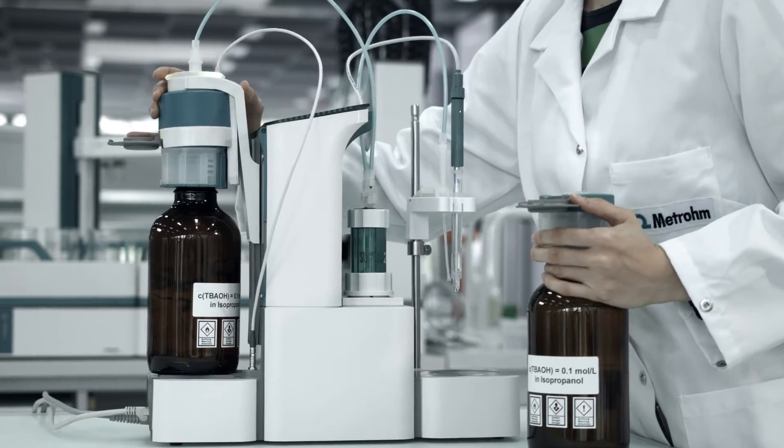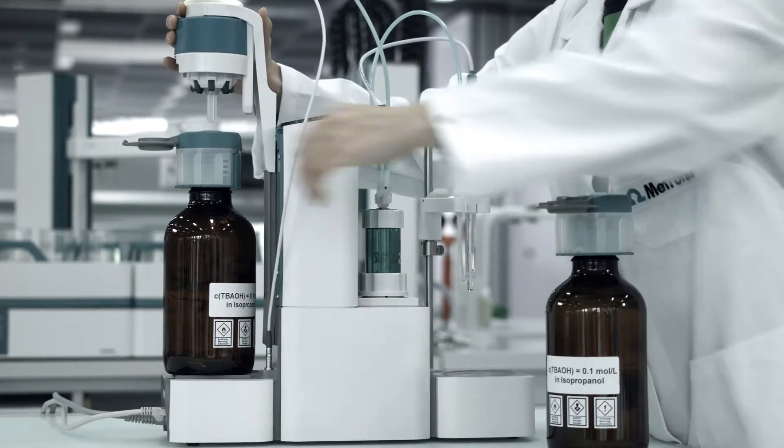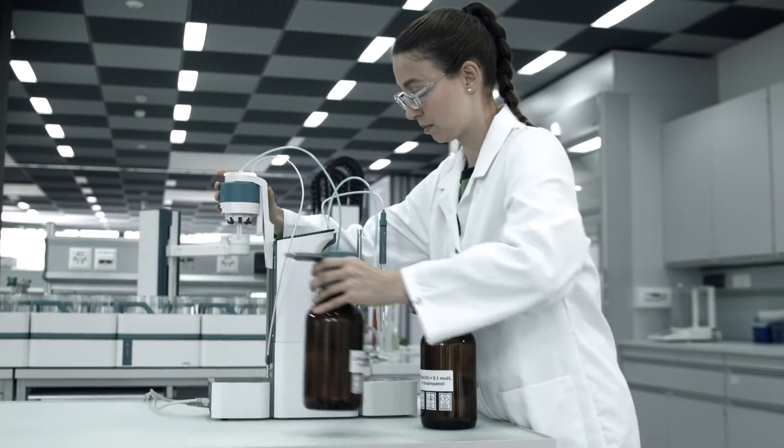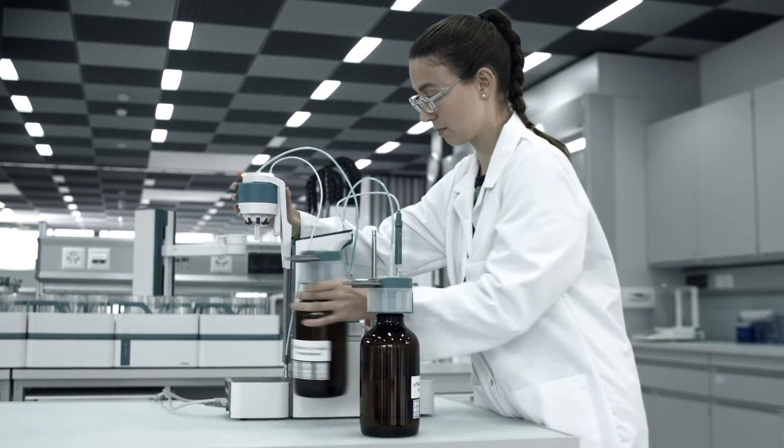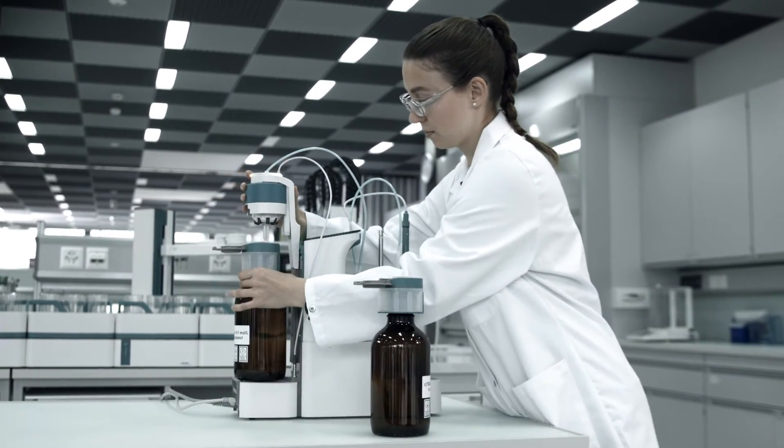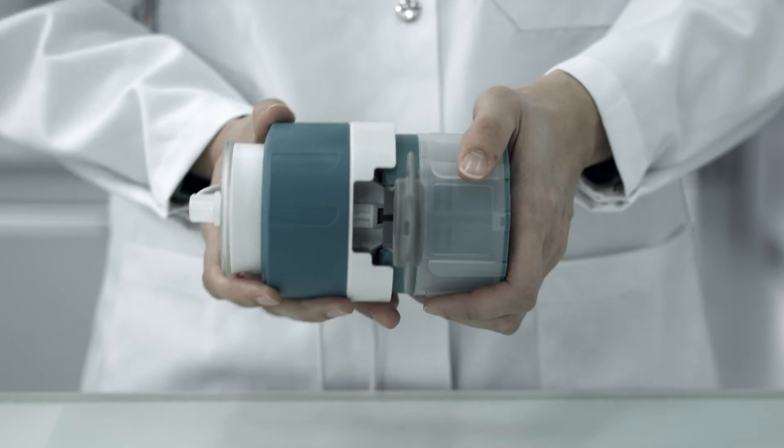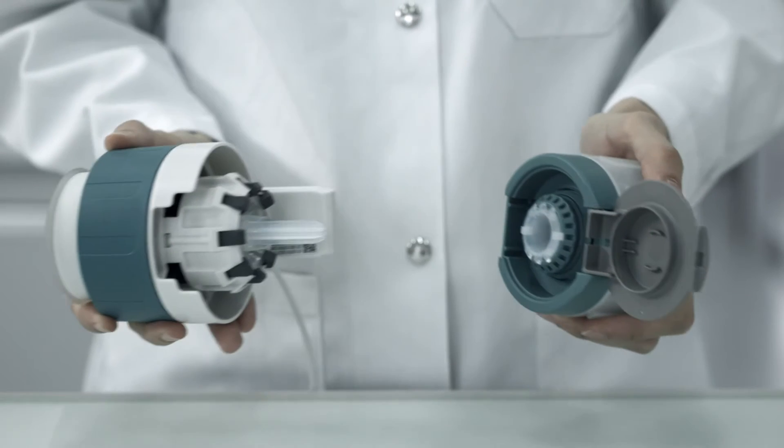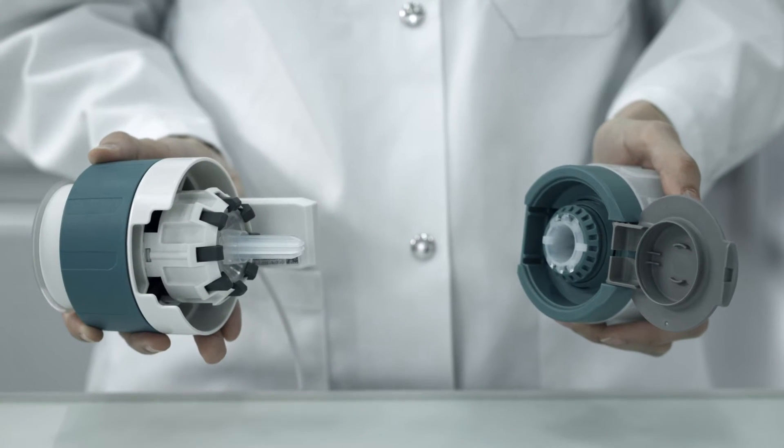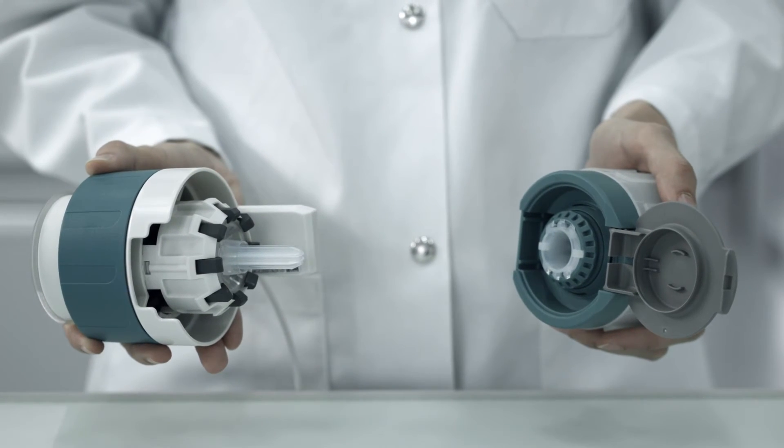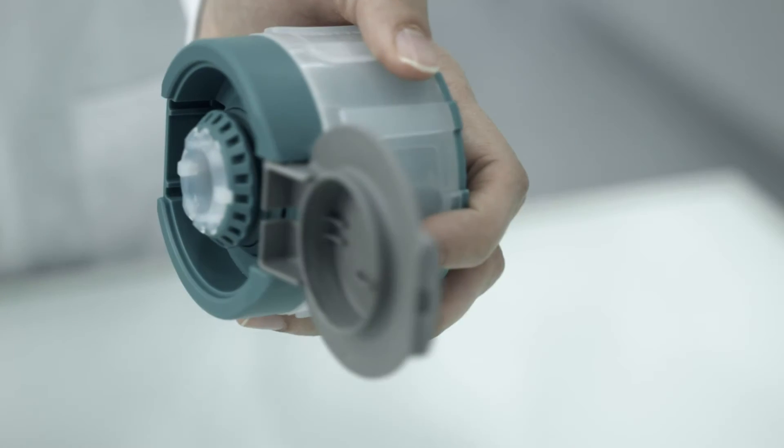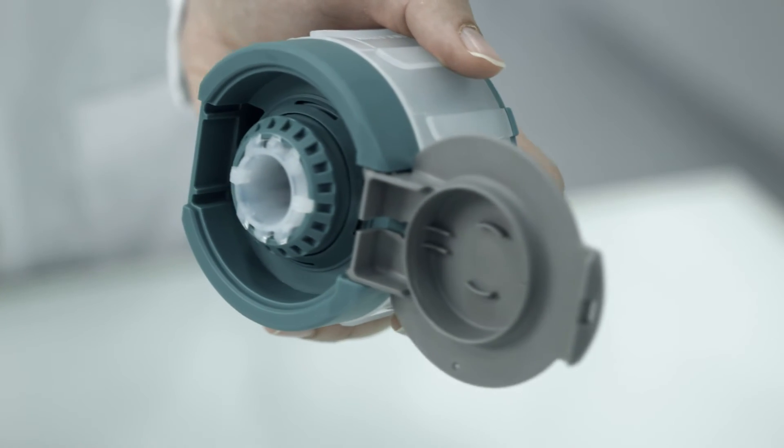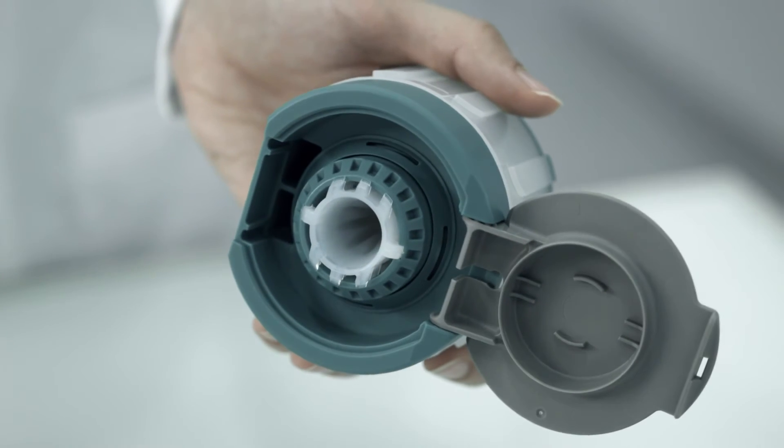With our new liquid adapter, you can exchange reagents without opening a single bottle. This liquid adapter connects your Omnis titrator with a corresponding bottle cap. The bottle cap is part of the reagent bottle.